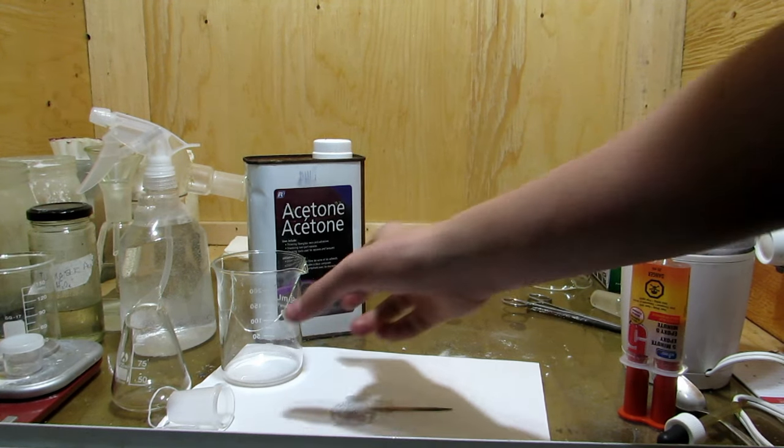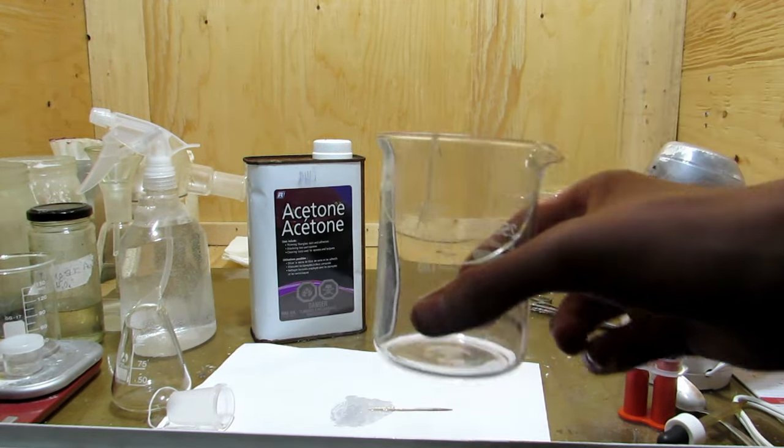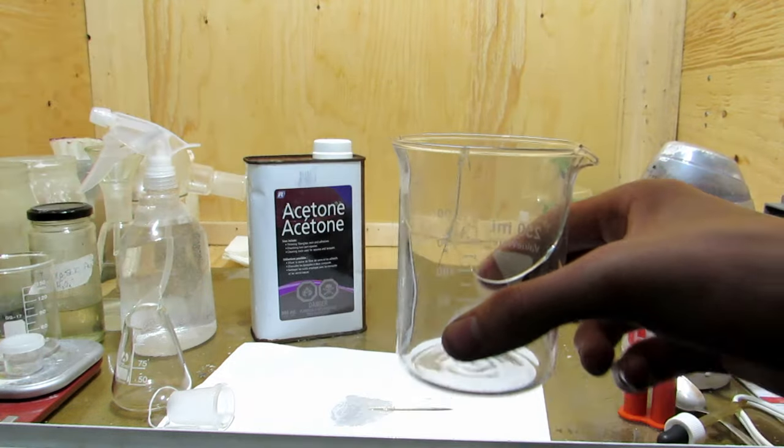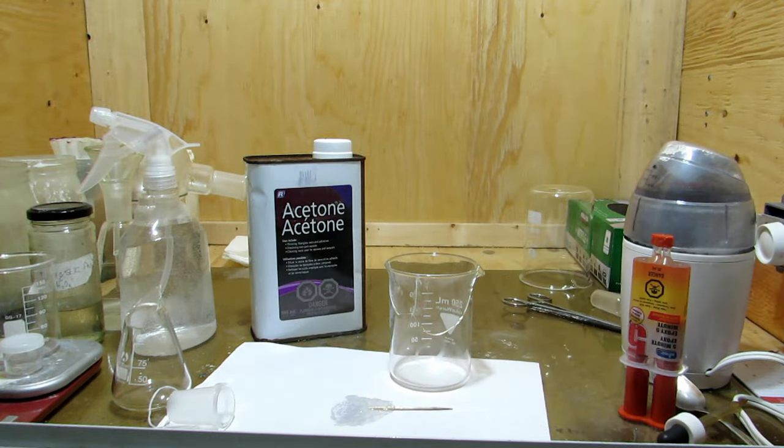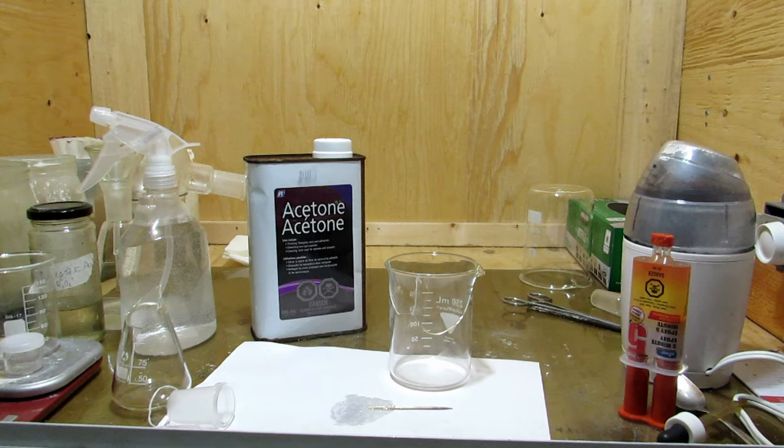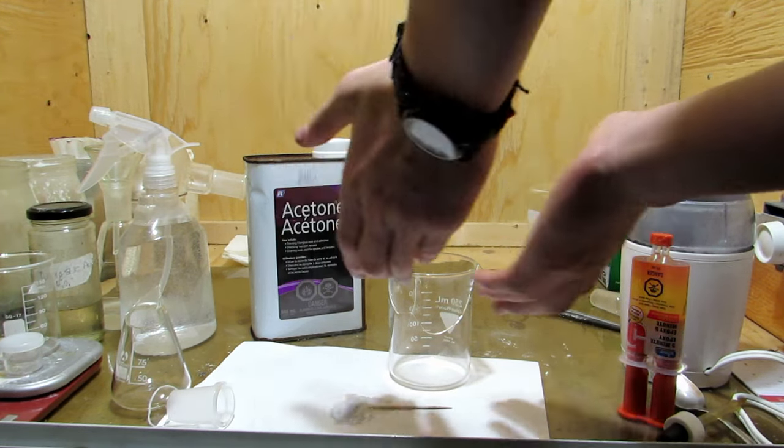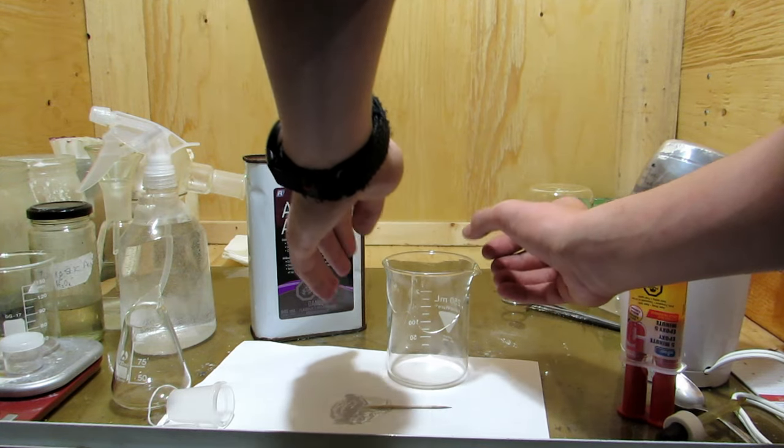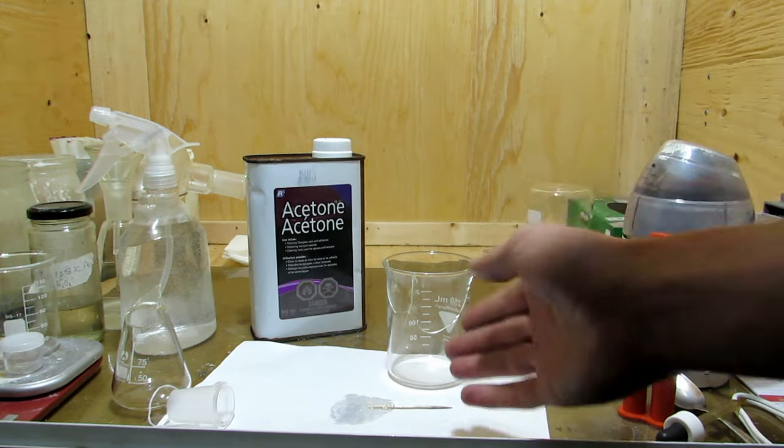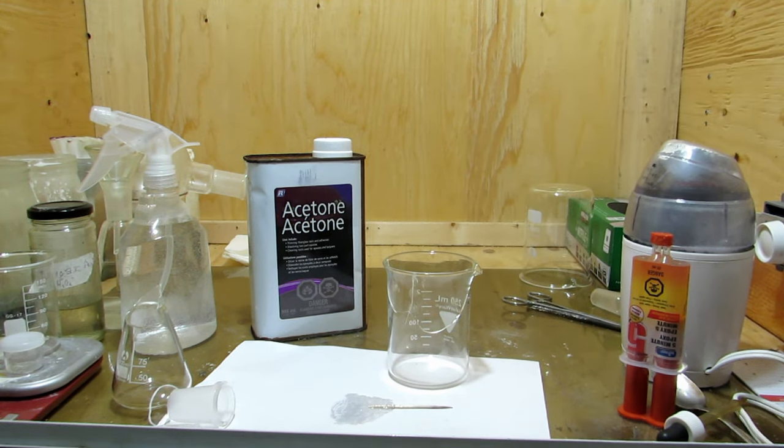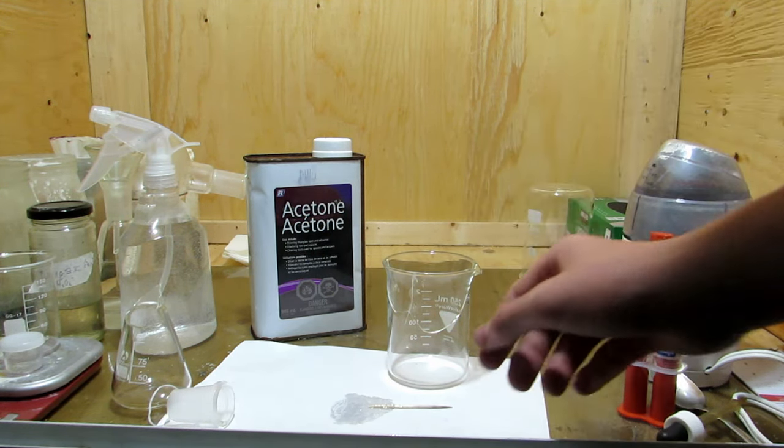Okay, so after you've held those first two pieces together until it sets, you can see that right here is the line, and it is most certainly not dry, as it is still quite flexible. During this stage, when it's tacky enough that it's going to hold itself together but still flexible, what you want to do is, if you have more than one piece, you just want to make sure that it's going to fit your beaker or whatever, so when it dries it will fit perfectly. Now, we don't have to wait for this to fully harden, just enough so that this isn't going to separate anymore.